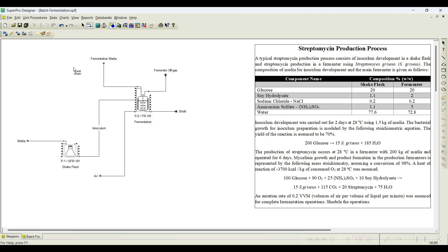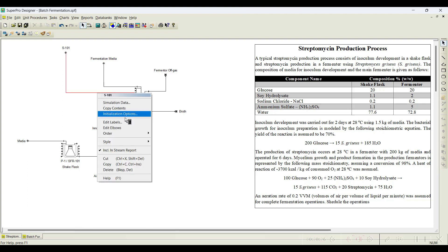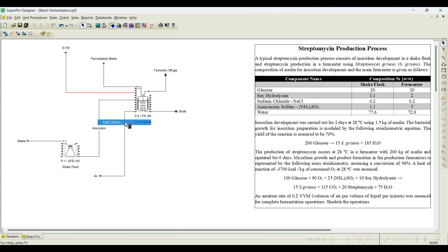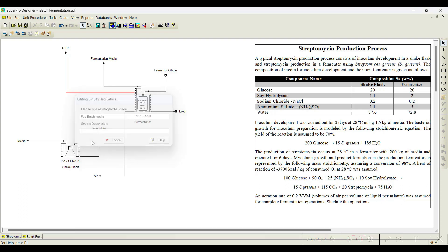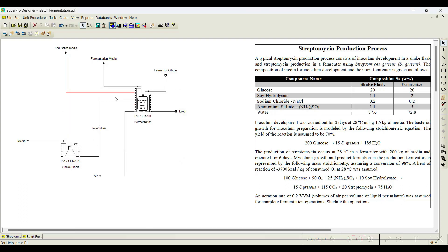Now I need to connect one more stream — that is the fed-batch stream. I will connect here and I will rename this as 'fed batch media'. So I will initiate this fed-batch media in later stages.